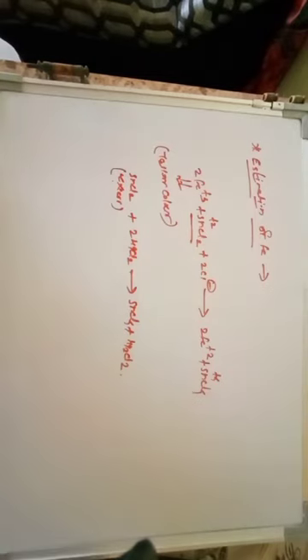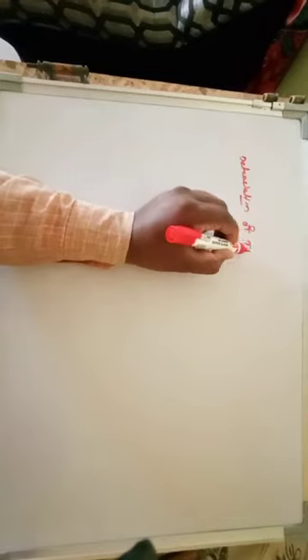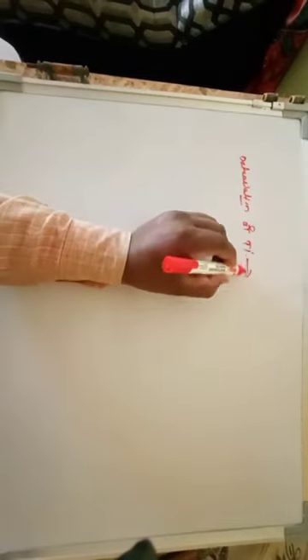Let us discuss the procedure for the determination of titanium from the diluted solution.